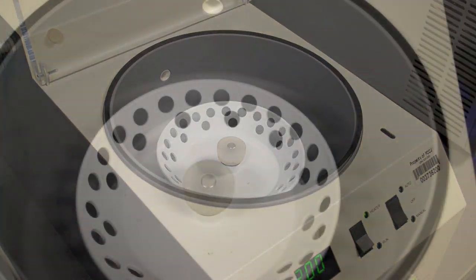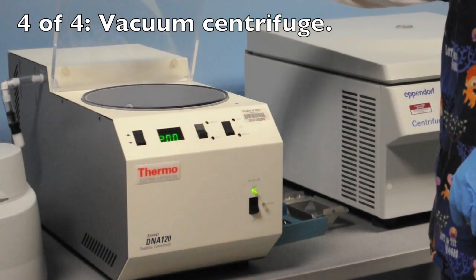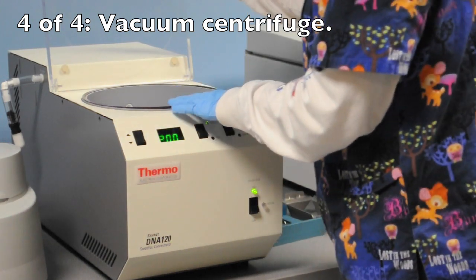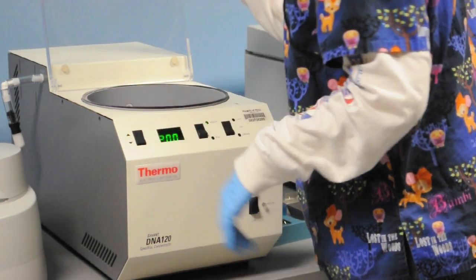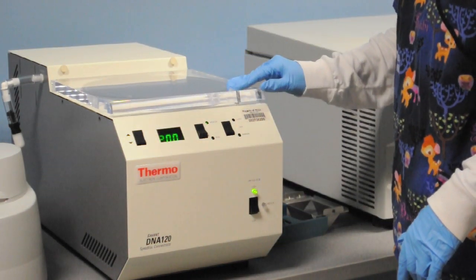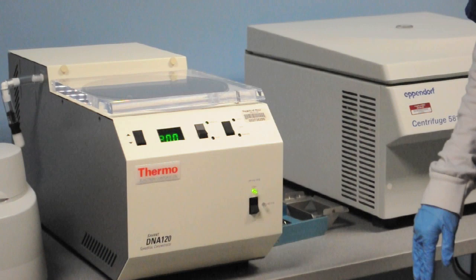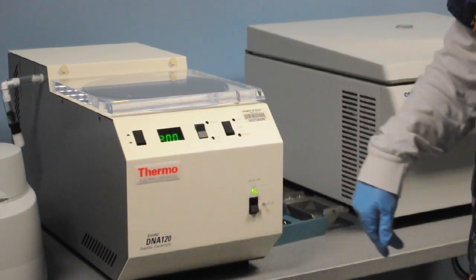This is a vacuum centrifuge. Vacuum centrifuges are used for drying — for instance, we use this with DNA techniques to remove alcohol. It's very important to check the membrane on this and make sure that it seats well against the top. The buttons are very straightforward: we can set the time of the run and the degree of vacuum.